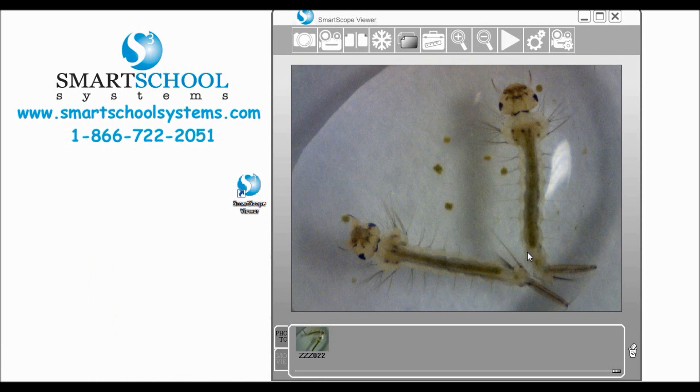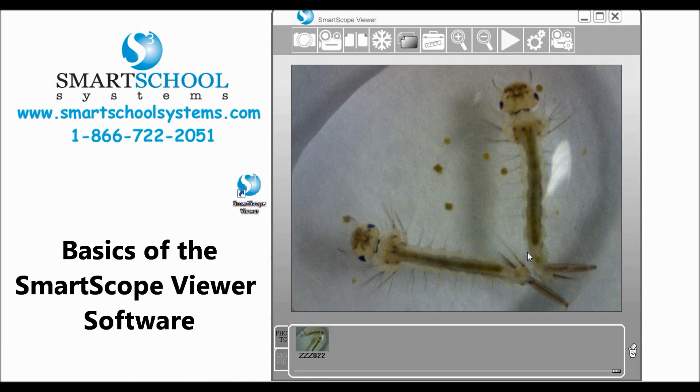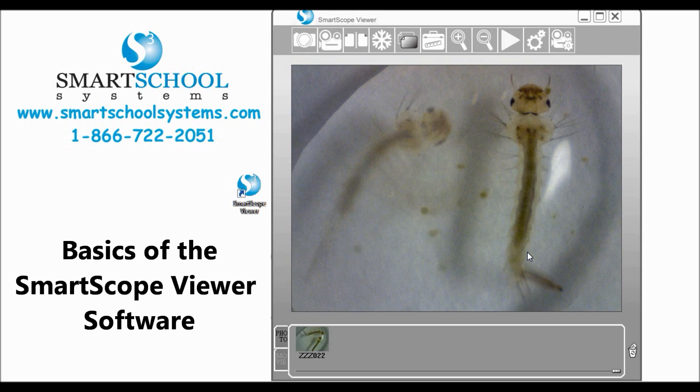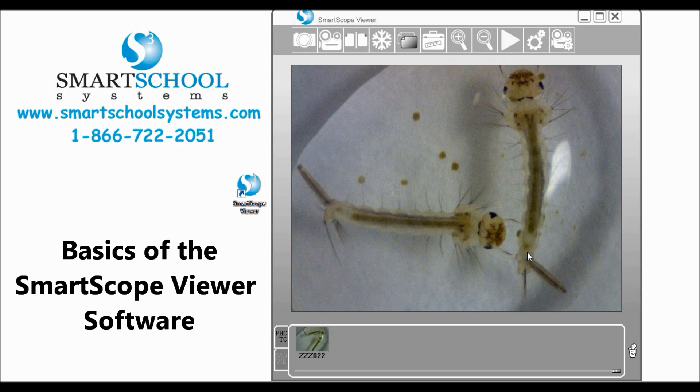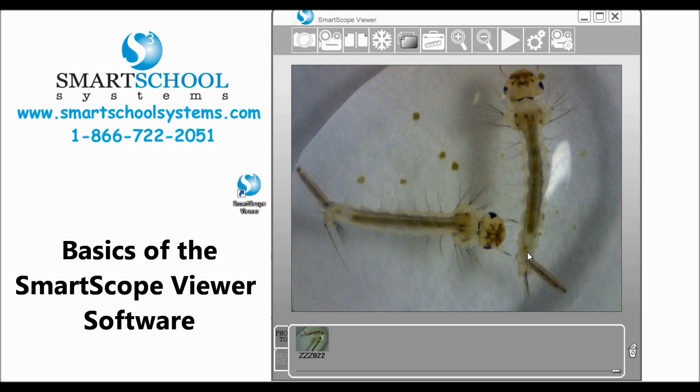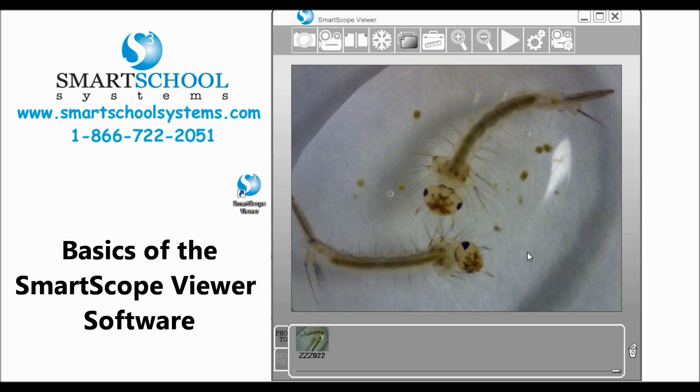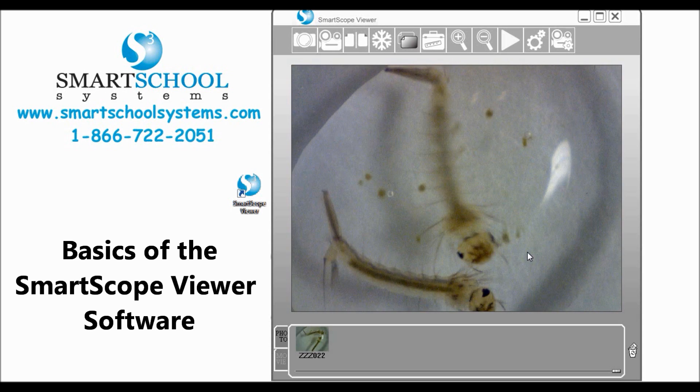Hello, today we're going to go over the basics of the SmartScope Viewer software that comes with your SmartScope handheld digital microscope. So let's go ahead and get started.